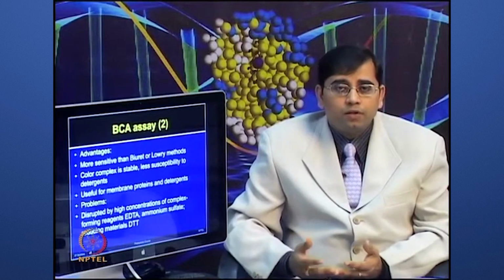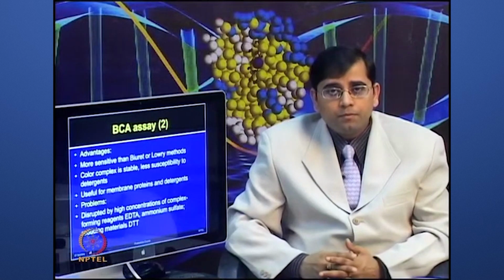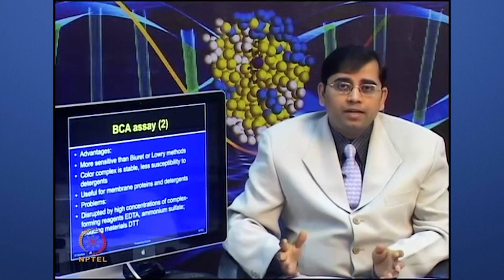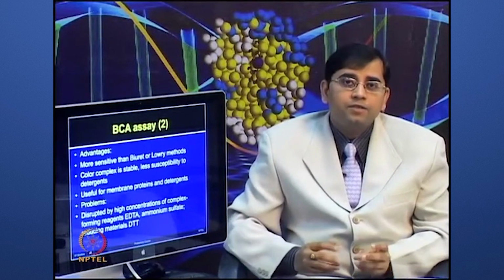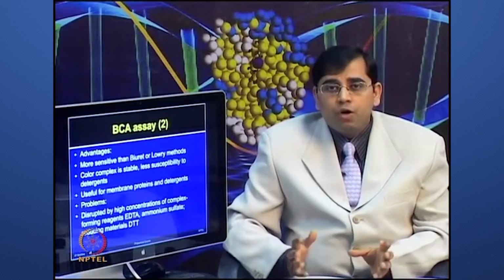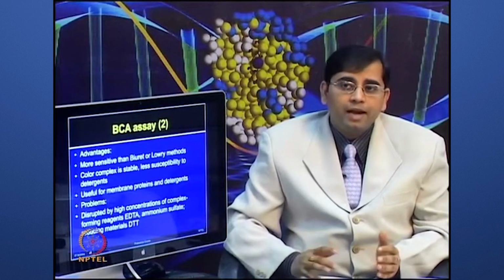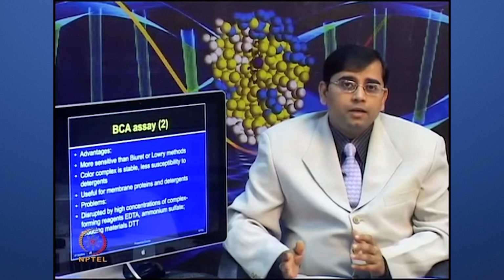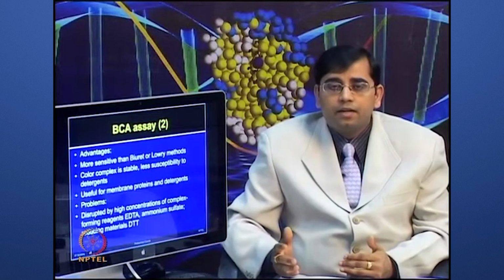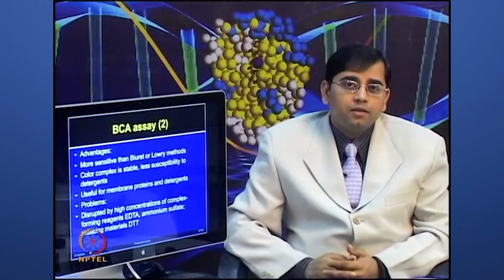Now, in all of those, if you are starting with an equal amount of protein, 100 microgram for example, but your quantification has some artifacts, because you have some components which are interfering and giving a false reading, your quantification will not be accurate, and rather than measuring only 100 microgram from the controls and the treatments, you are actually measuring 90 versus 100 or 100 versus 110. So, there will be some artifacts if you do not start with the exact protein amount.